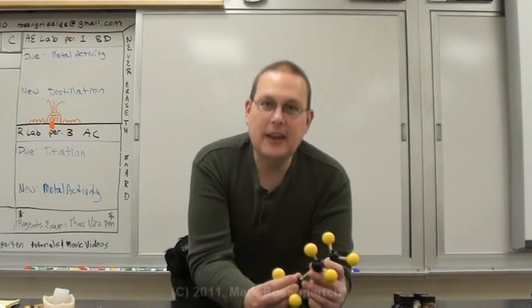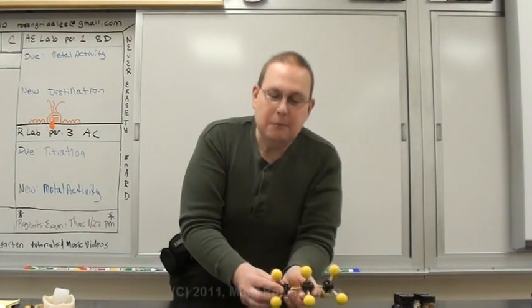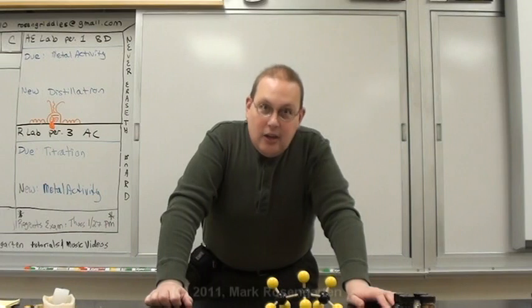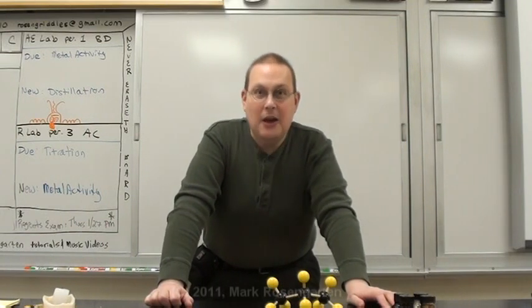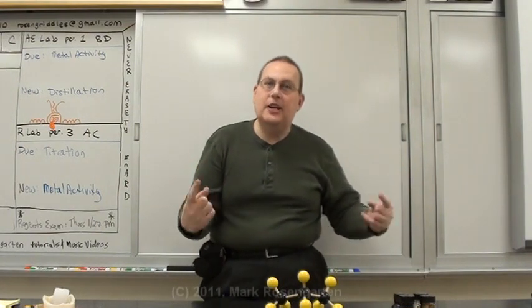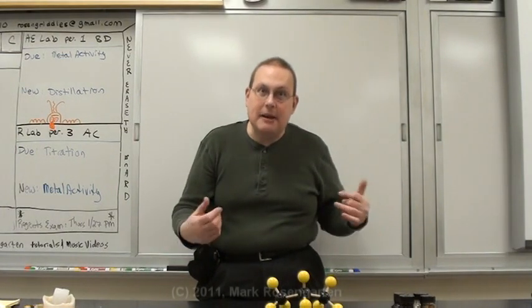Well, it turns out that every time you add a carbon onto the hydrocarbon chain, the boiling point increases because the attractive forces between the molecules get stronger. We can use this to separate the molecules out on the basis of how many carbons there are in the molecule. Now, the big tarry molecules are going to have very high boiling points, so it's not going to take a lot of cooling to condense them out and collect them.